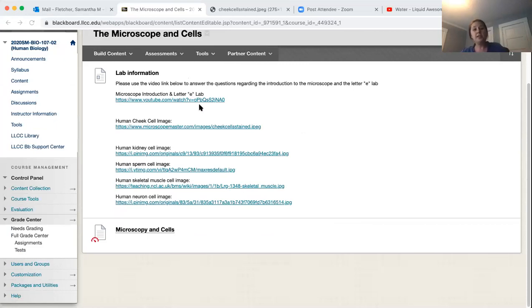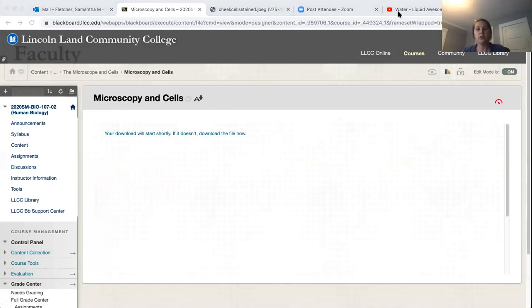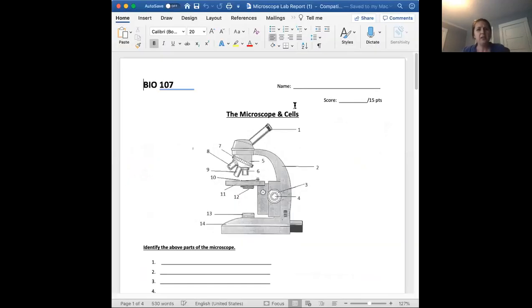Like I said, all of the links that you will need are going to be included here. I do have a tutorial video included that's going to walk you through all the different parts of a microscope, and then also through the portion of the letter E. I also have a slide for the human cheek cell, kidney cell, sperm cell, skeletal muscle, and neuron cell image. I'm going to pull up this lab really quick, and I'm going to show you all of the parts that I want you to cover, and then what parts we're going to modify just slightly. So let me pull that up, switch us over.